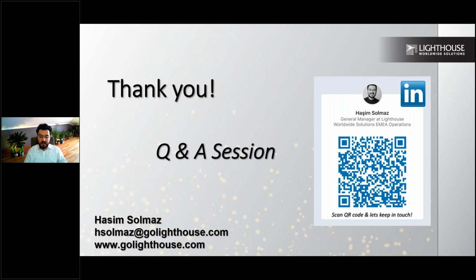Can we set up number of particles before filter for the device if it was measured using different counters? Yes, you can. You can have a different setup connected to the same system, and you can collect both sides, let's say 0.3 micron and larger particle sizes in upstream as well as on your downstream side. So you can align these two data with the time stamp. So you will be seeing the efficiency increase or decrease throughout your filter.